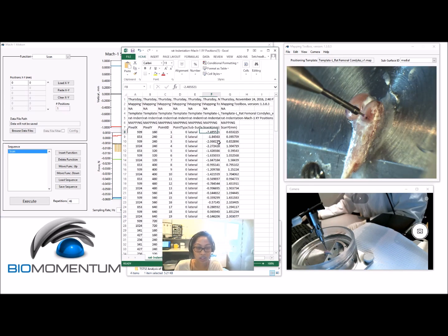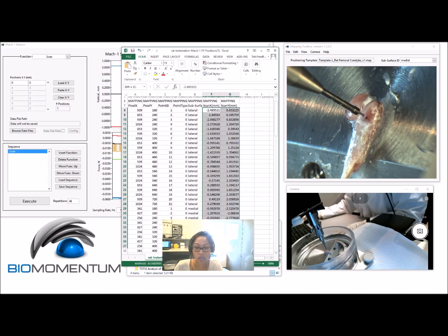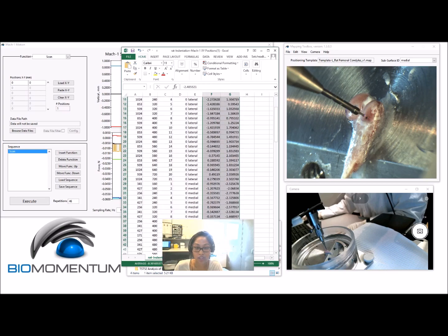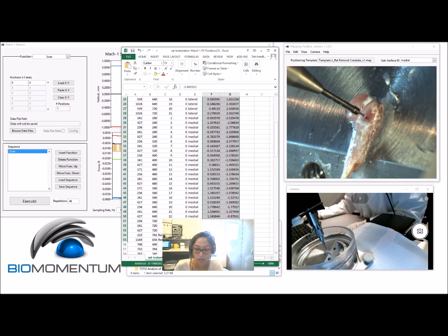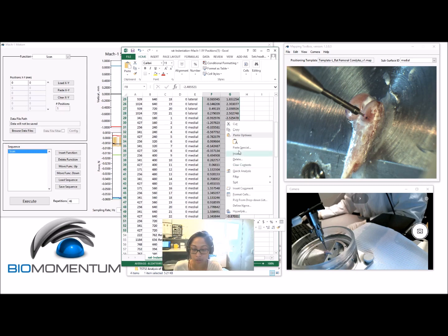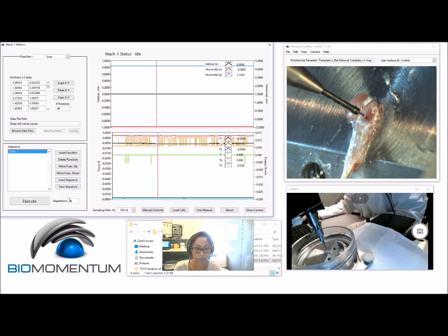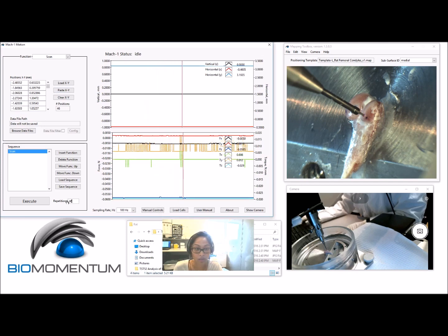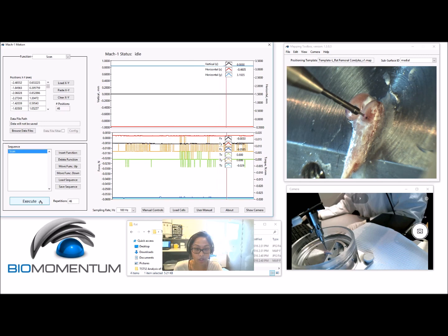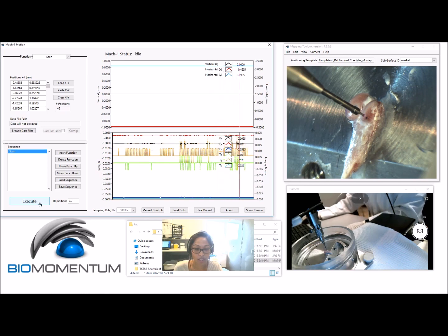Import the X and Y coordinates of the position grid from the previously created file. Copy those positions into the scan function. In the sequence repetition field, enter the number of grid positions of the scan function.